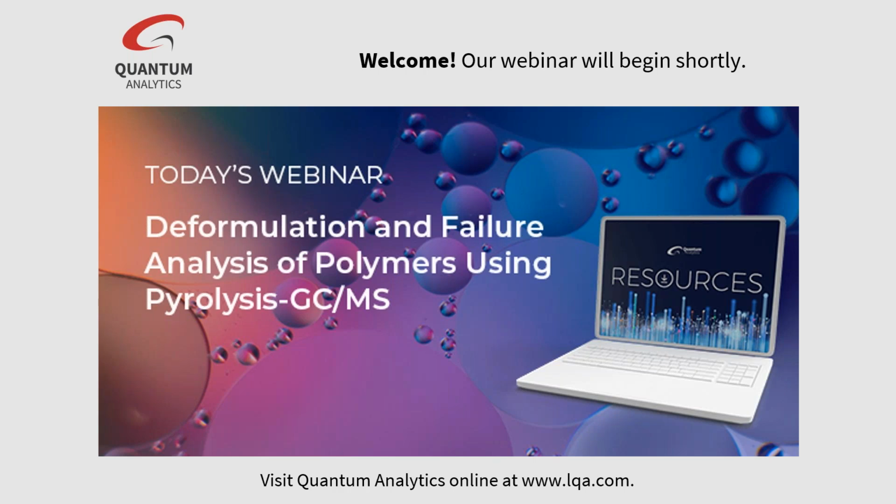If you've been following along with our materials analysis webinar series this year, you are going to remember that we tackled reverse engineering with FTIR in early February. Then earlier this month, we had a session dedicated to improving additive manufacturing qualification with X-ray microscopy. Today, we are going to continue our journey towards improving our materials analysis expertise. And we'll be doing this with the help of our partner, Frontier Labs, as we explore the topic of deformulation and failure analysis of polymers using Pyrolysis-GC.